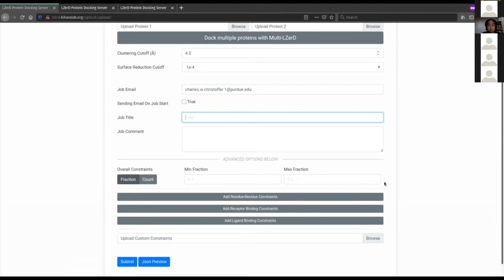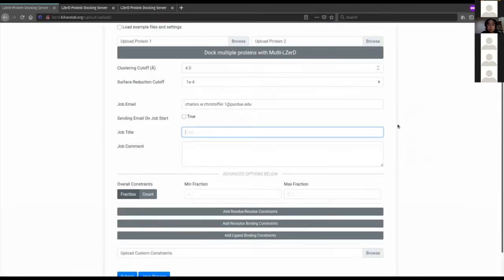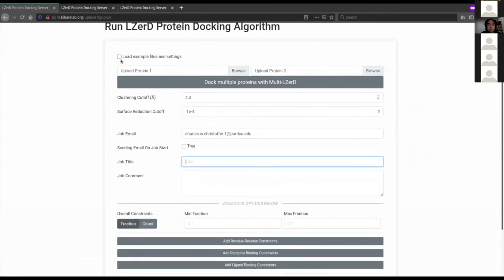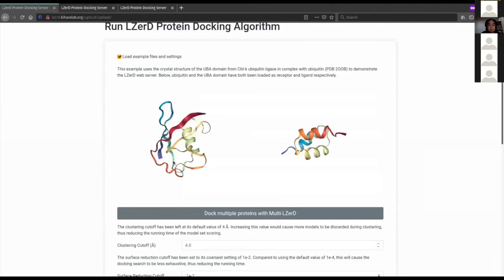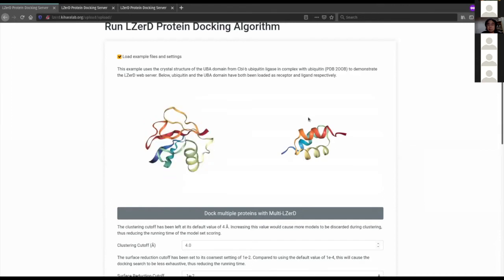Are there any questions? After this I'm going to talk about how to specify constraints on docking. I'm going to click the button at the top of the page to load an example. If you're looking at this webpage on your own, you can click this too. This example loads a particular ubiquitin and ubiquitin ligase complex.